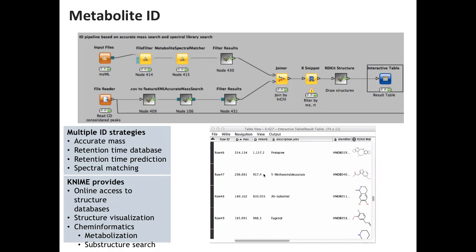You have something like a calculation for predicted retention times versus actual retention times? Yes, we do, but it's not a tool that we have right now. We've been toying with it for a while. In my experience, the added value is rather limited. Because, when you think about it, it's pretty evident why that should be the case. Although we've published papers on it. We've published a paper on lipids, we've published quite a few papers on retention time prediction.